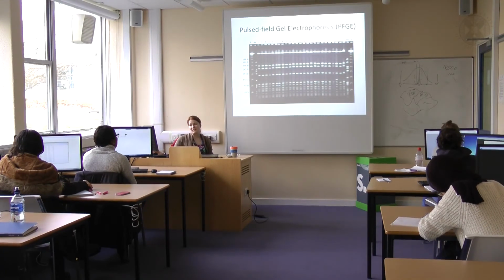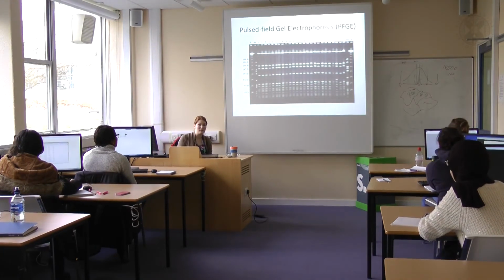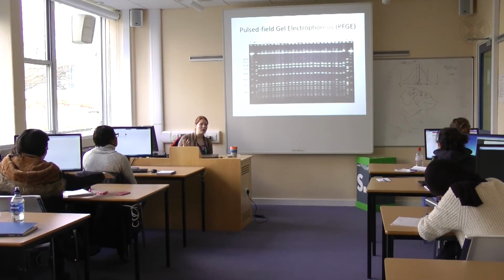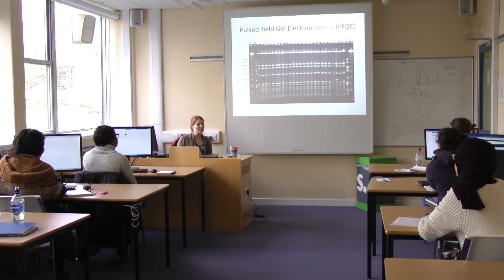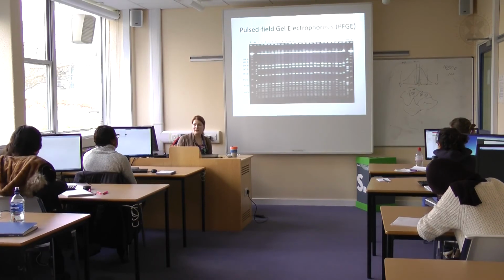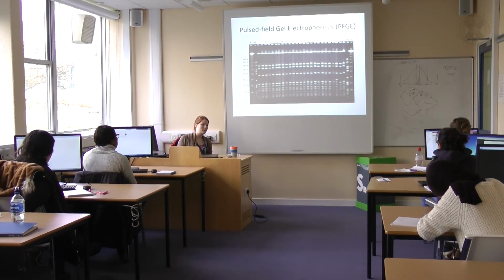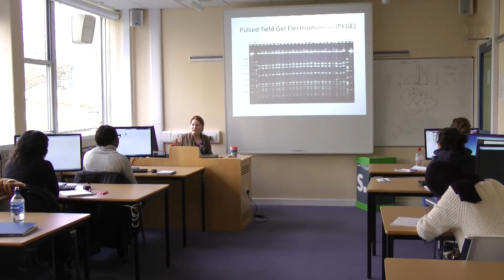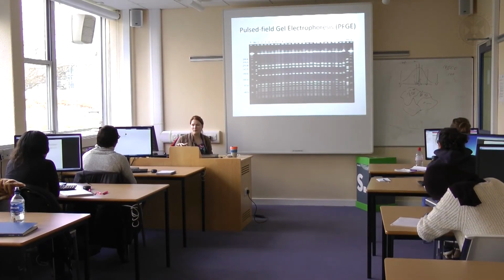There are some limitations to this. Can anyone imagine what a limitation might be? Can you guess? If you're just chopping up chunks of DNA and looking at the size, it's possible that you could get two chunks of DNA with different content but the same size, and so they would come up as having the same fingerprint. So it's okay, but it's not ideal, because there's some ambiguity there. Different labs may also use slightly different enzymes, which might cut things slightly differently. So if you're doing it multiple times from different labs, it's not very comparable either.